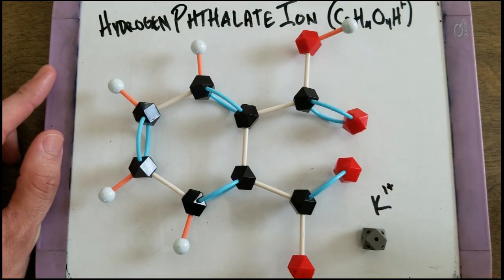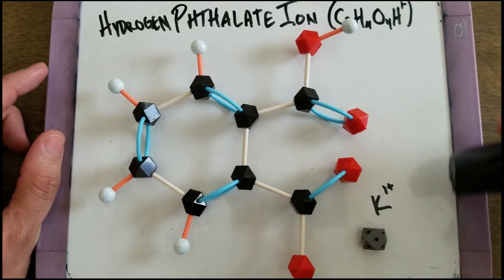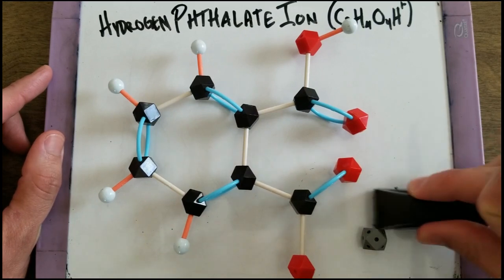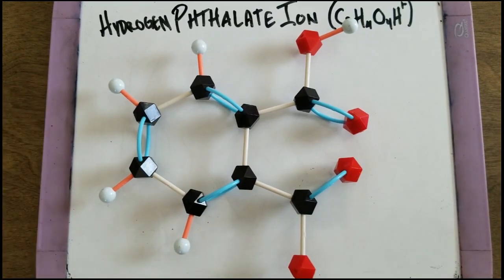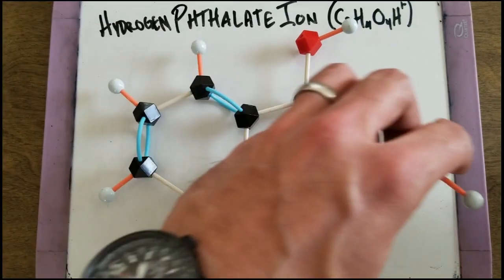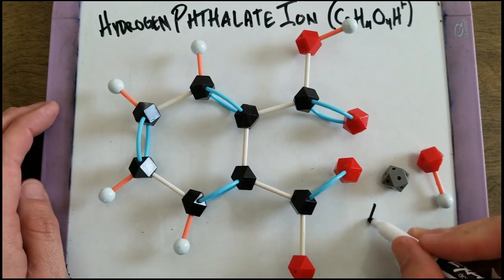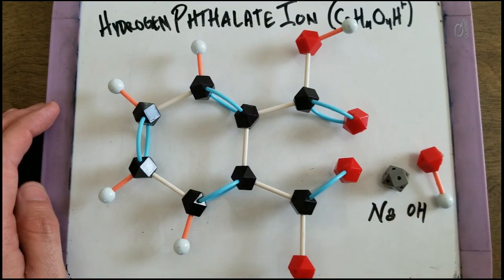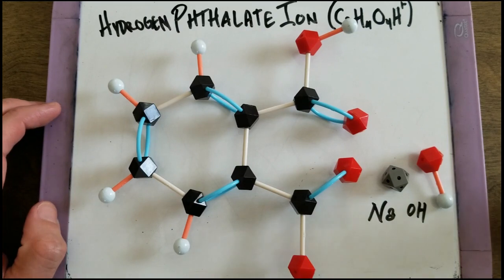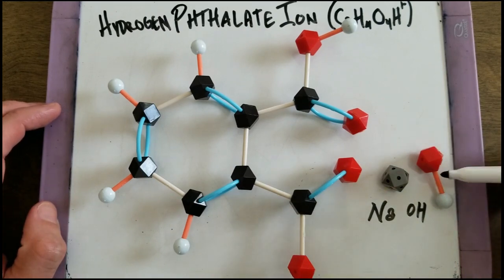So really in this lab, it's going to be that the hydrogen phthalate ion, which is the acid, is going to be reacting with the base, sodium hydroxide.